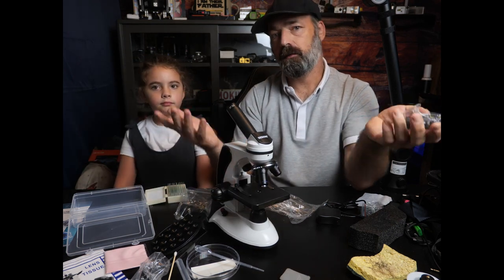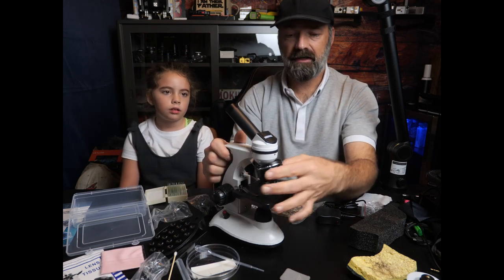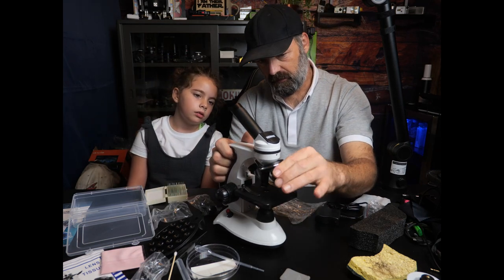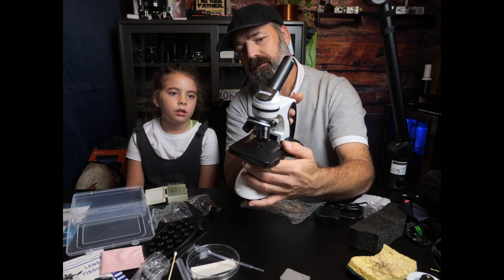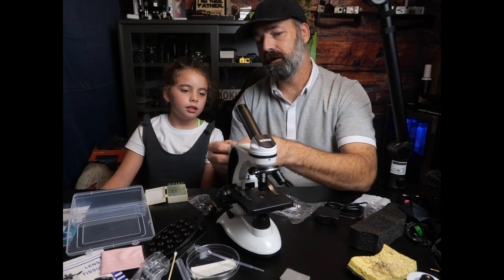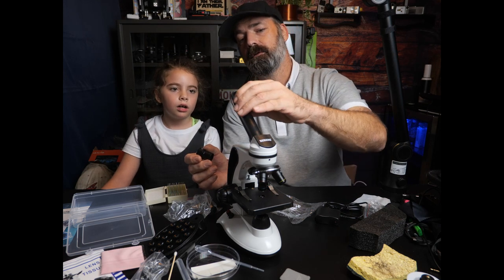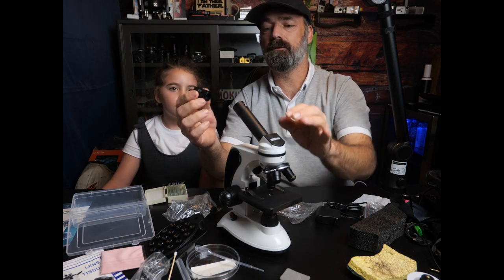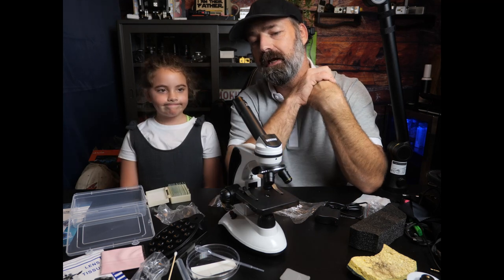That's how you figure out the magnification. So if you wanted to go the strongest, you would take the 25 times eyepiece and use the strongest lens on the microscope, which is 40 times. 25 times 40 is a thousand times. If you wanted to go to 2,000 times, you would take the 2 times and slide it in the tube, then stack the 25 times on it, and now you have 2,000 times magnification.